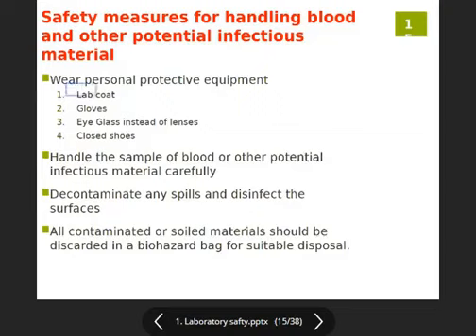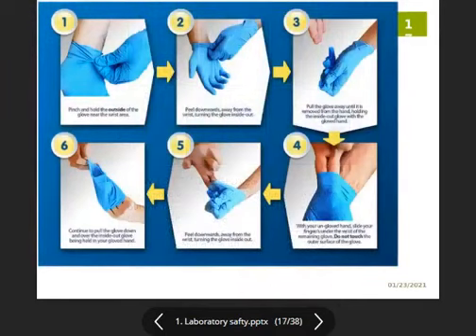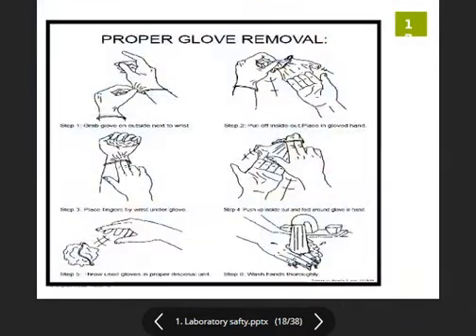As I told you, lab coat and gloves are very important in the lab. So you should know how to put on the gloves and how to remove the gloves. Dear students, as you know, corona is around and everybody knows how to use gloves. So this is just a few pictures to show you how you can remove the gloves. Okay, so this is the method of removing the gloves.